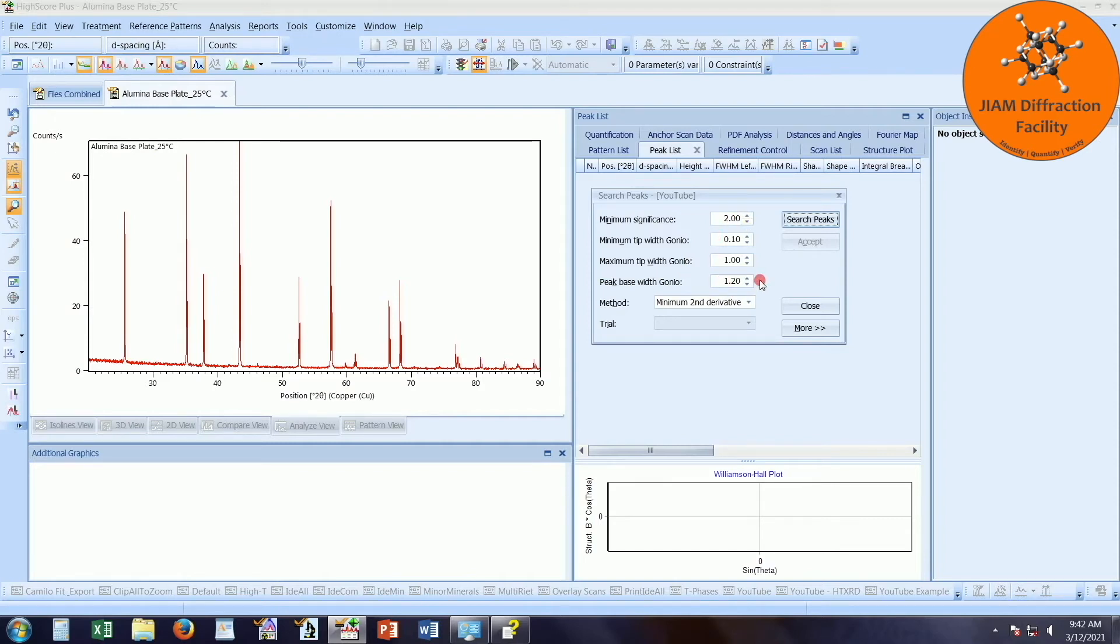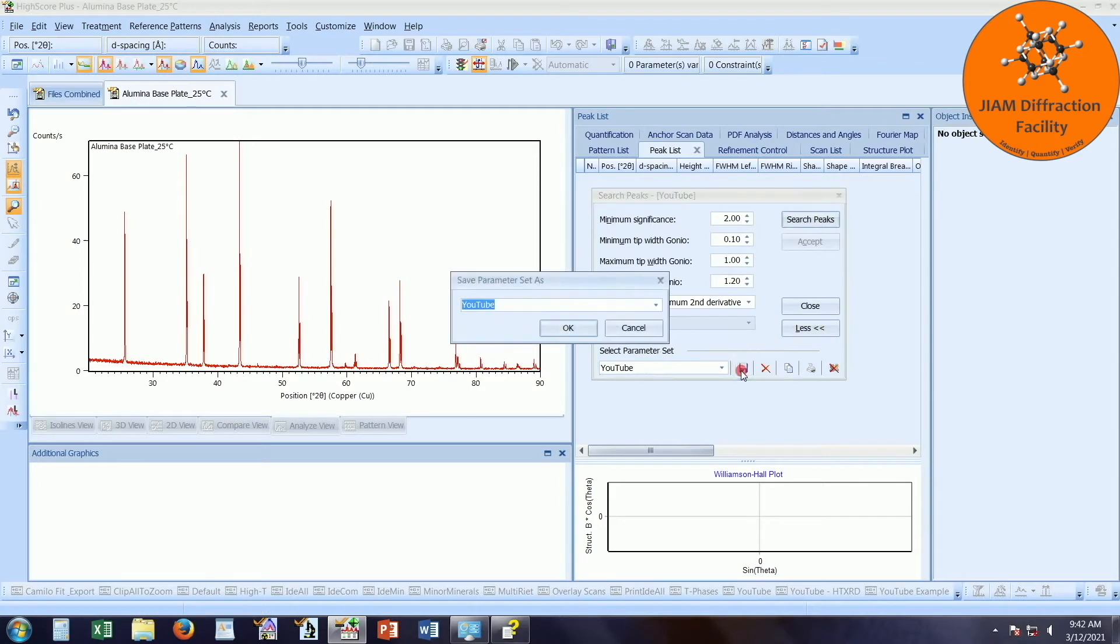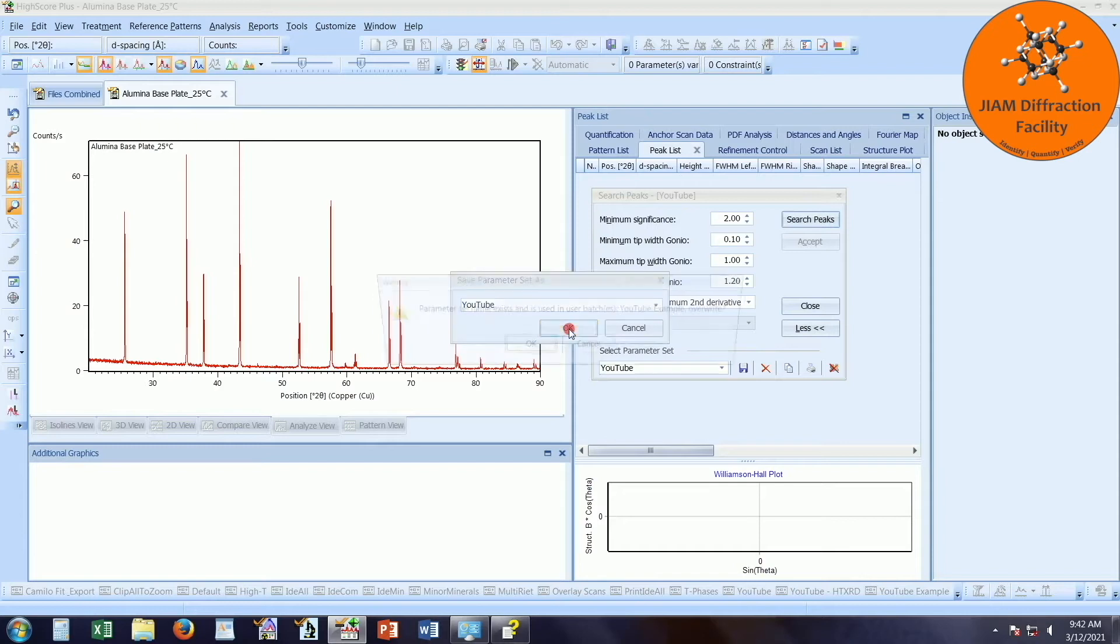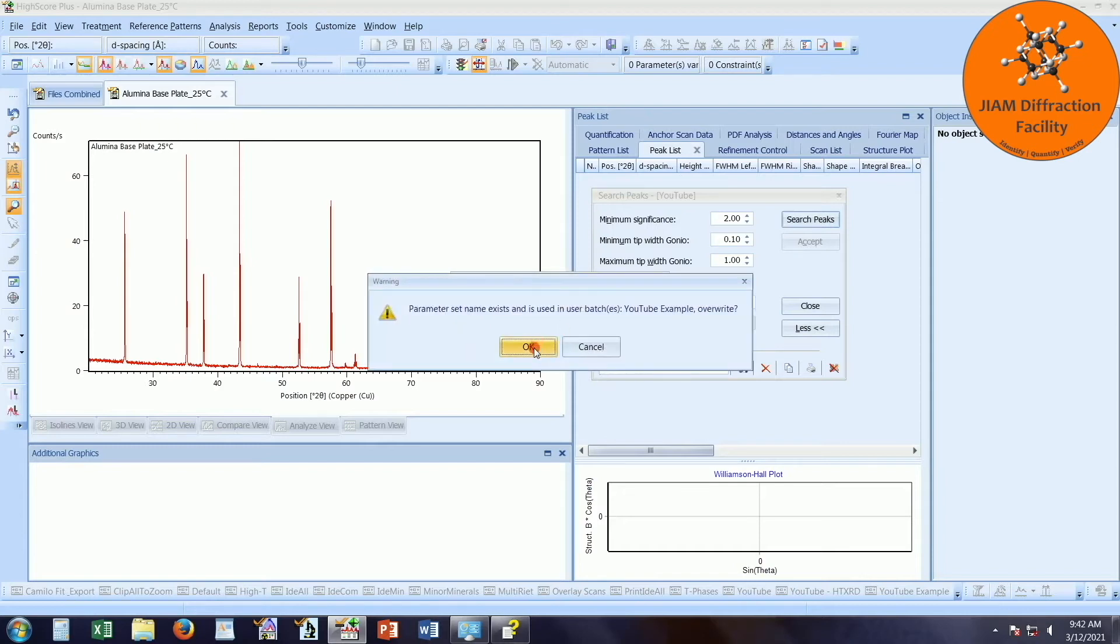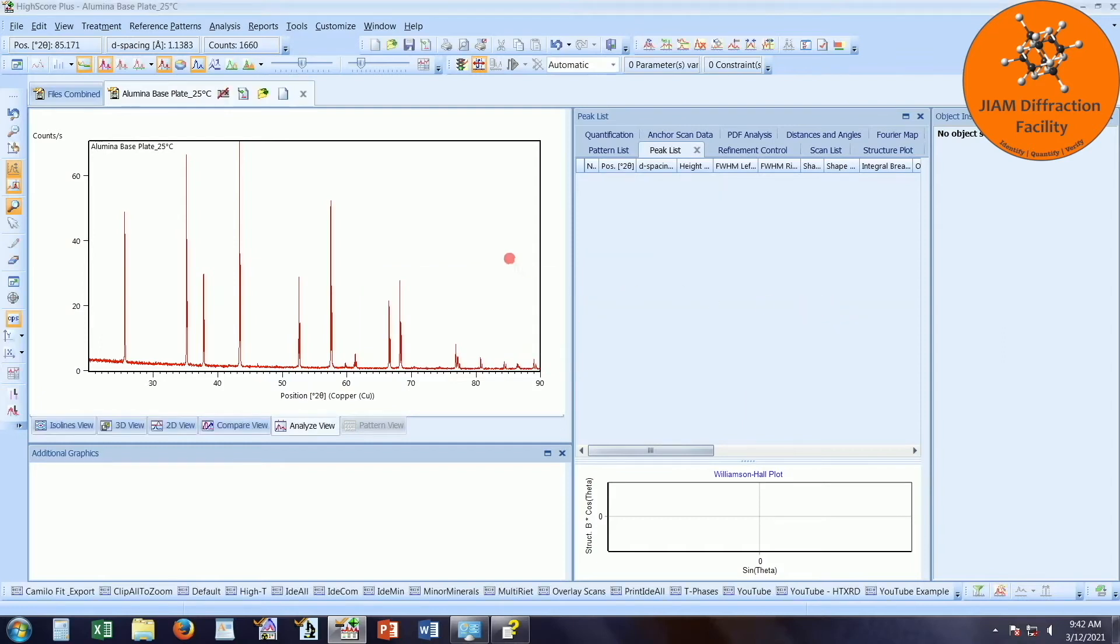Once you do find some good numbers to put in here, you can left click more. And once again, save your parameter set as whatever you like. Once again, I will save mine as YouTube. I will say OK to overwrite it. I will close out of this.